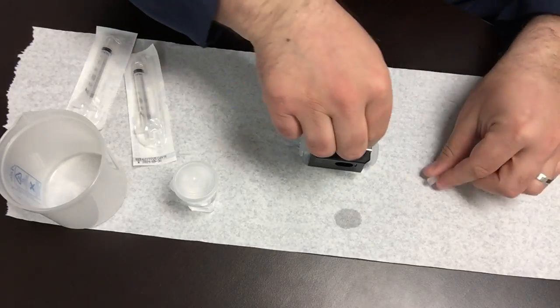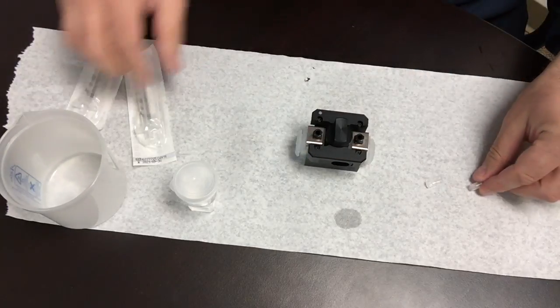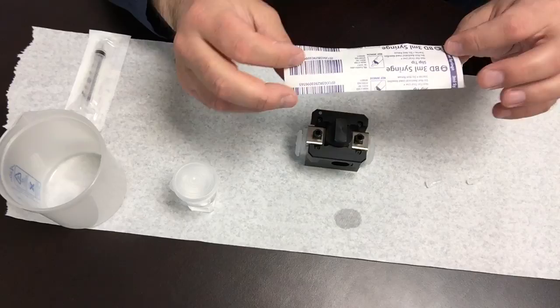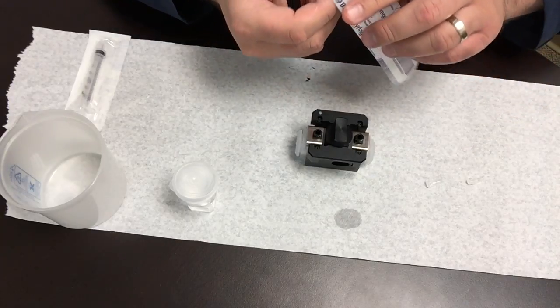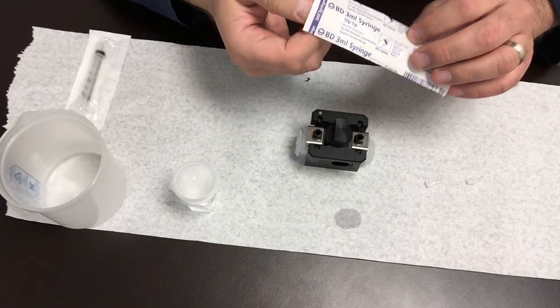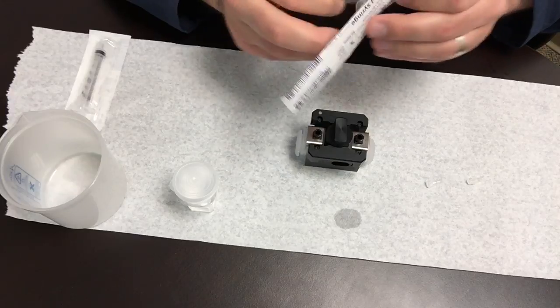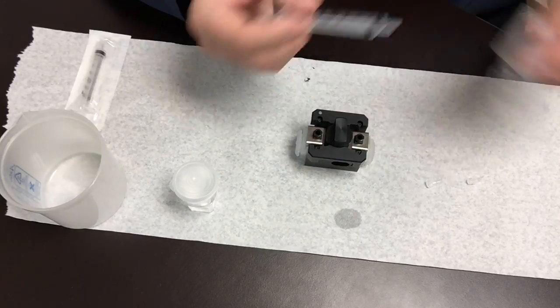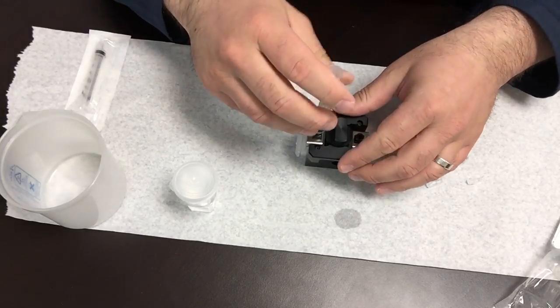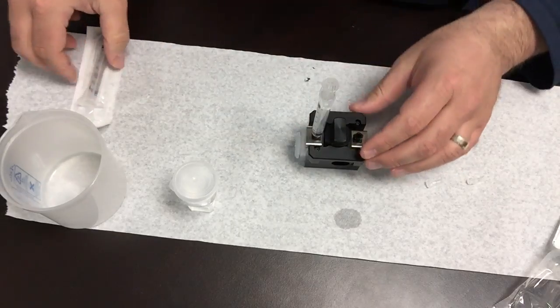You take the caps off. Take a syringe. You can use a one milliliter syringe, three milliliter or five. I like to use probably about three. You place the empty one here on one side.